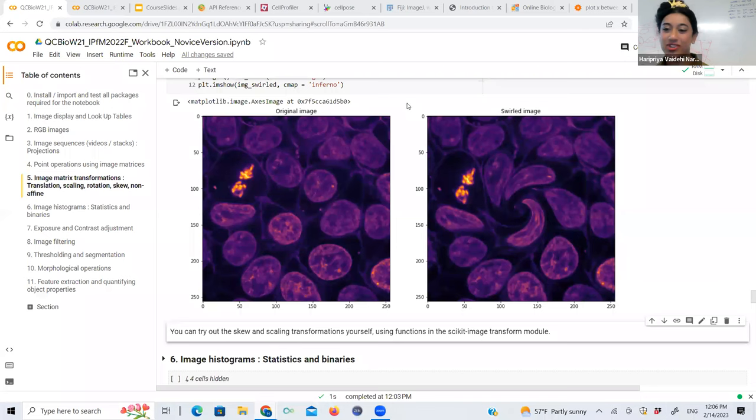What is the average across the whole thing? One value, just one value that gives me the middle of that distribution. Is my image bright or is it dark? That's all I want to see. So in that case, you can go in for just the mean value, and that would just give you that one answer.